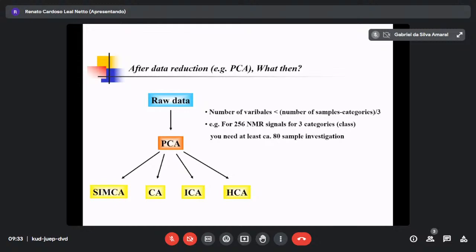Now, many people, because you already have LCMS, but to collect the sample takes money. In the beginning, Gilberto mentioned, now I measured only one sample, two samples, three samples. I detected thousands of metabolites. I want to classify based on three samples. It doesn't make any sense, right? You need replicates. Then there is a rule of thumb here.